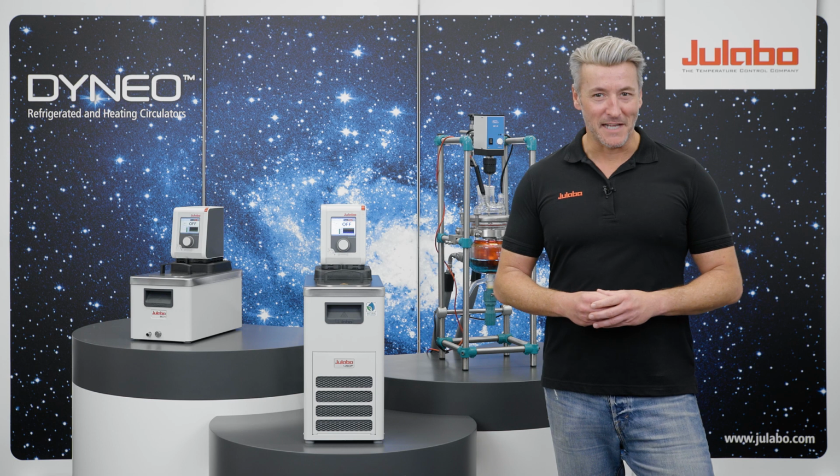That's it. Please note, when the remote control mode is activated, direct operation of your DYNEO on the device is not possible. I hope this short tutorial was helpful for you.